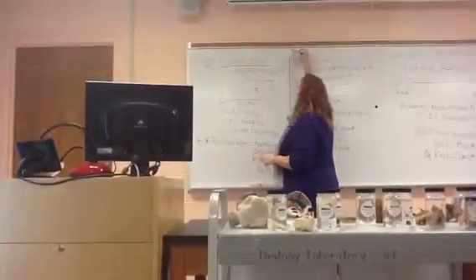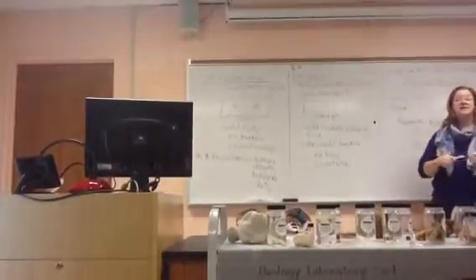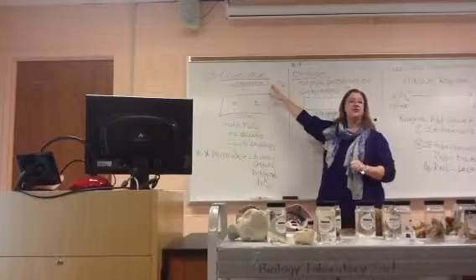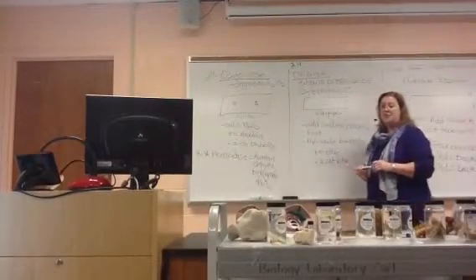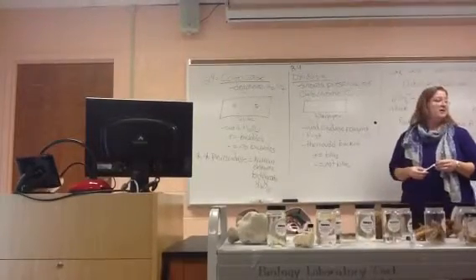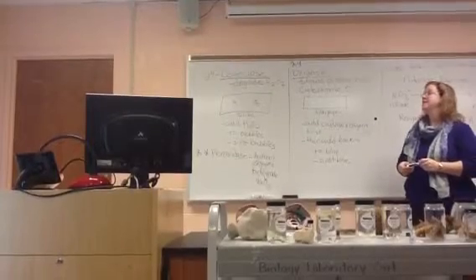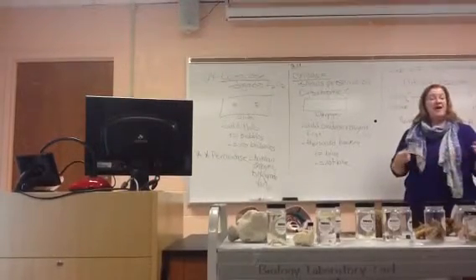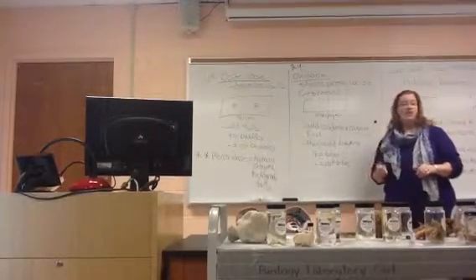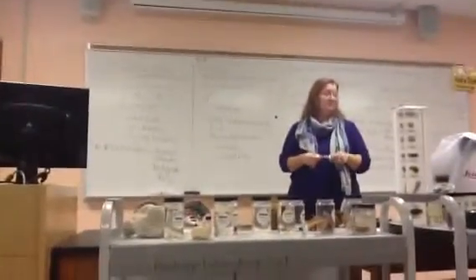This is lab 24 as well. Catalase is an enzyme that some bacteria can make to degrade hydrogen peroxide, H2O2. That's the stuff in the brown bottle that you pour on cuts, right, to sterilize them. If bacteria have catalase and they're using it to degrade hydrogen peroxide, they're degrading it into things that don't hurt them, harmless substances to them.